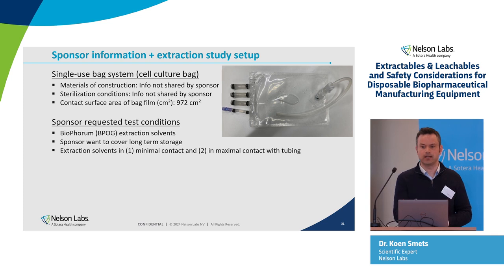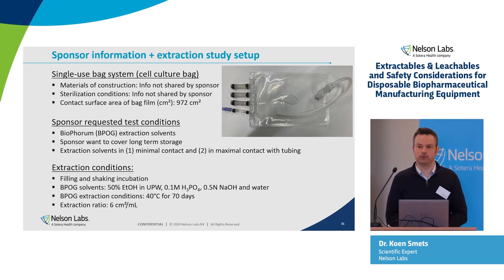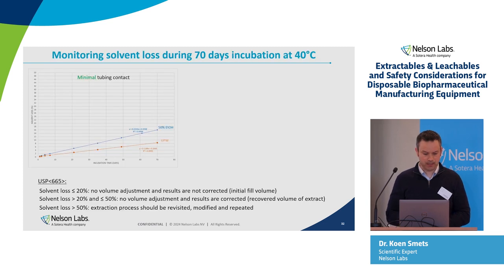So minimum contact, the clamp is close to the bag film, and with maximum contact, the clamp is at the end of the tubing. So for the extraction conditions, filling and shaking incubation was used. The 3 or the 4 BPOG solvents were selected, and the extraction time was 70 days at 40 degrees Celsius. Extraction ratio 6 square centimeter per ml.